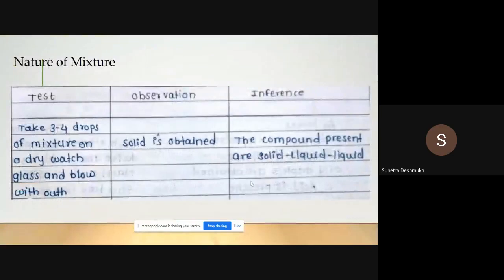Here I am explaining that I have considered this mixture, but whenever you are conducting mixture separation at laboratory level, you don't know which mixture has been given to you. So you have to start from the beginning. That means you have to identify the nature by yourself. Here I am giving you the mixture for example, and you have to separate in that way, but in the laboratory it won't happen, you have to identify everything yourself.